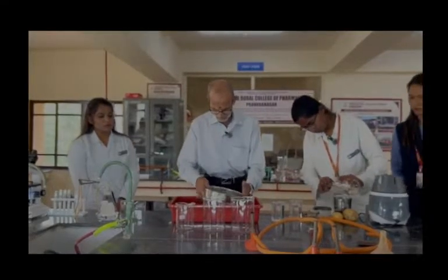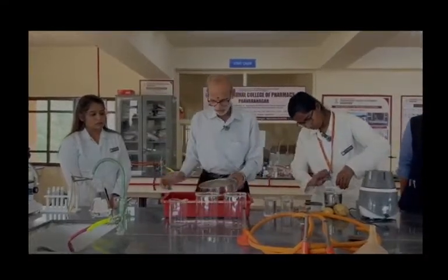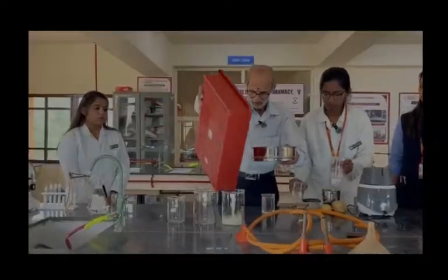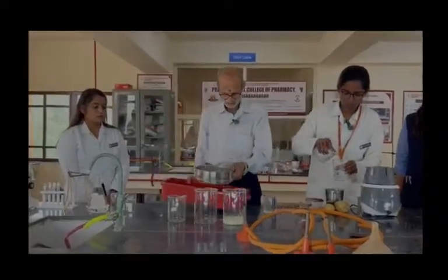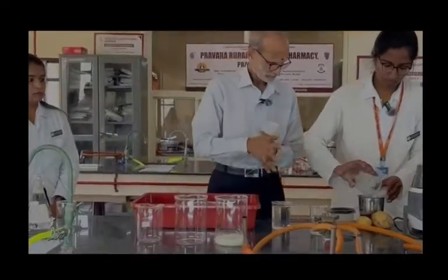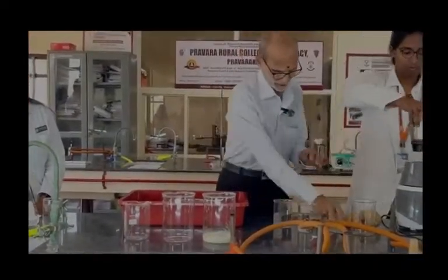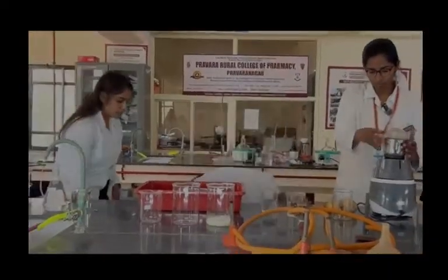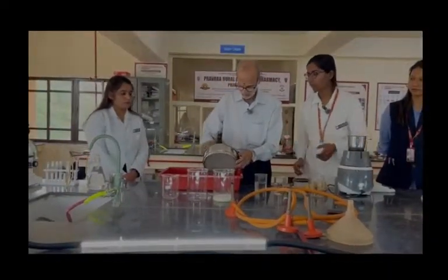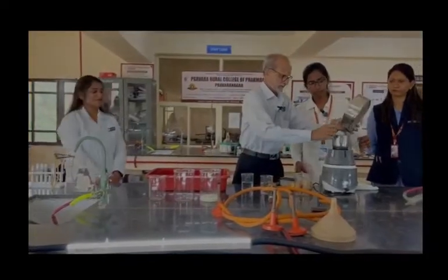Okay, we have passed it through this. Now you can see here the starch, which we are going to transfer into a beaker. Okay, more. So you can see now the starch suspension. Wait a minute. Here at the bottom you will find the starch which is getting settled. Take this as well. And thereafter the starch is given further washing with the water.